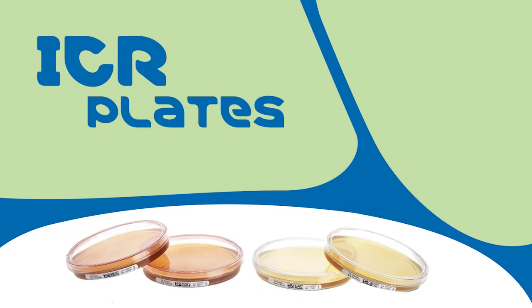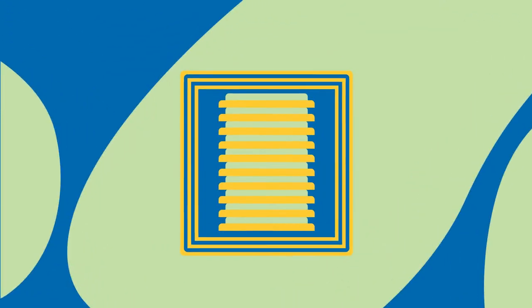Ready-to-use culture media are used for the application's air and surface monitoring. This video shows the use of triple-bagged gamma-irradiated culture media for use in aseptic environments as well as the growth of microbial strains. Triple-bagged ICR plus contact and settle plates allow a safe and sterile transfer into clean rooms by removing one bag per material lock.